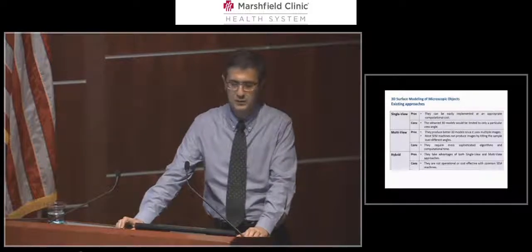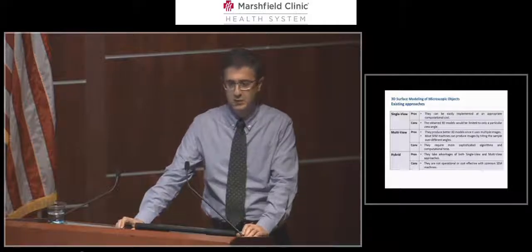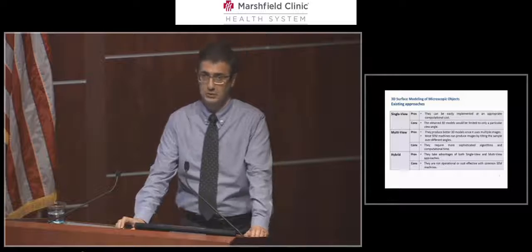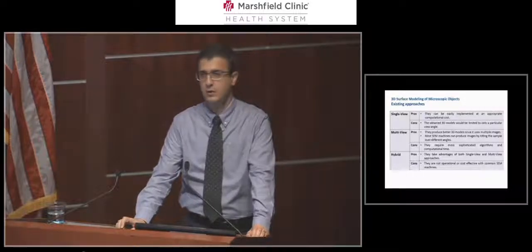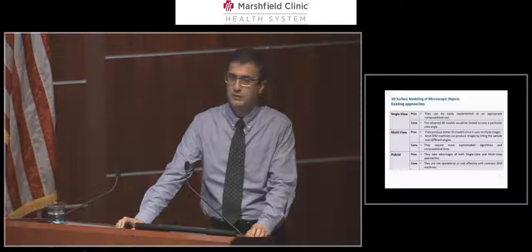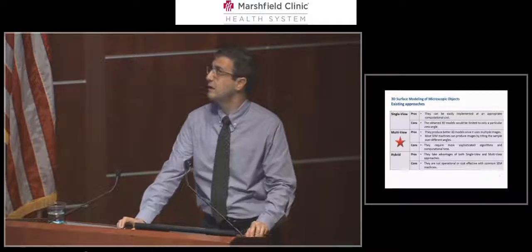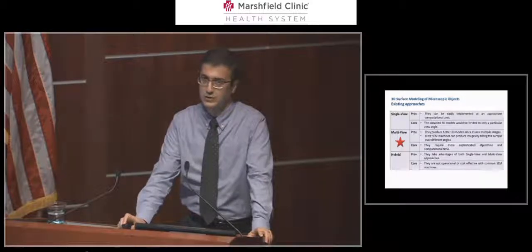Multi-view algorithms can generate a better 3D model, but they need more sophisticated algorithms and computational time. Hybrid algorithms can take advantage of both single view and multi-view approaches, but they are not operational and appropriate with common SEM machines. So based on their cons and pros, we selected the multi-view approach in this study.